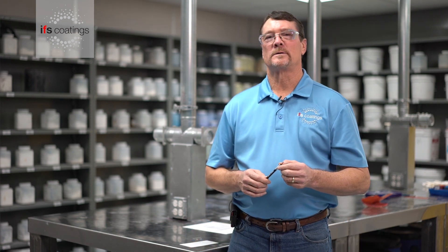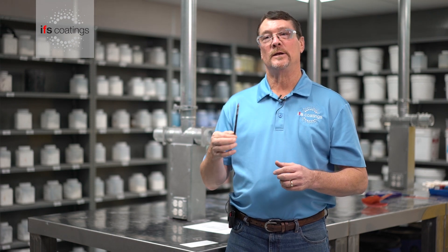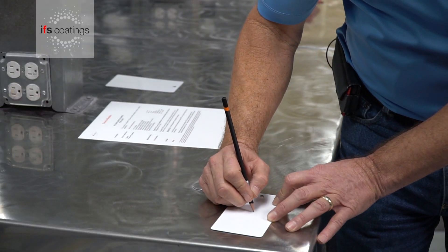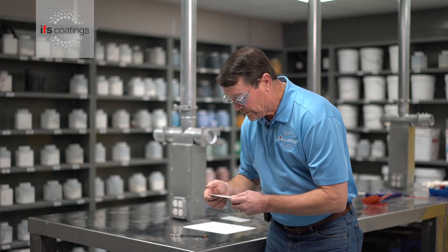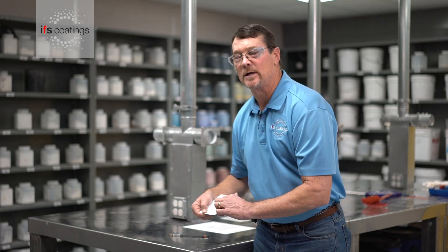In the last shot we used the mechanical device, but many people won't have that particular unit. You can also do the test by hand with the pencils. You simply place the pencil and, using average pressure, push down and go in a straight line. Based on that, we did not get any gouges into the substrate.